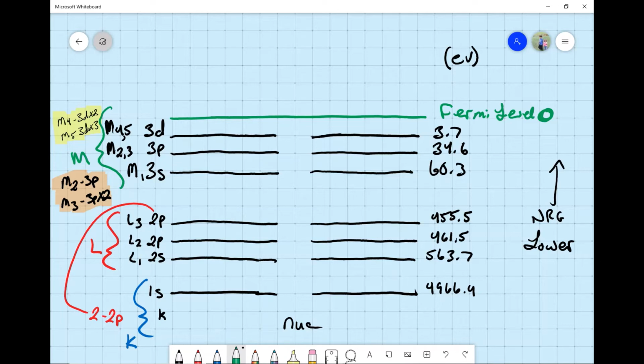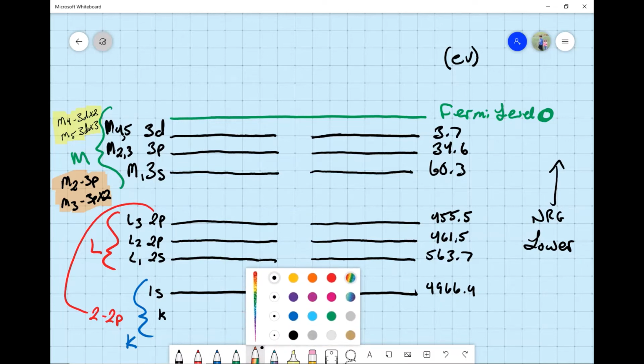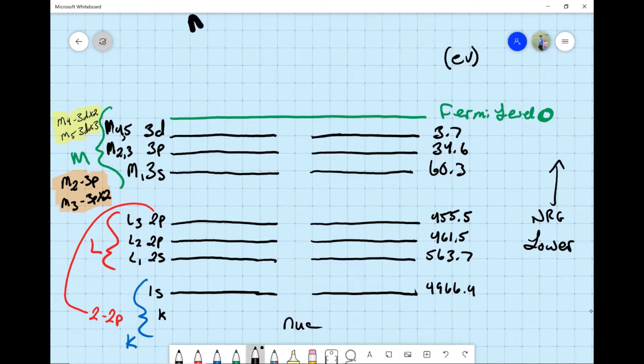All right, so we have an electron now that came in, and so I'm going to use glitter, and we have our incoming electron. And let me label these two sides first. So we're going to call this the Auger. My tablet's really angry with me.